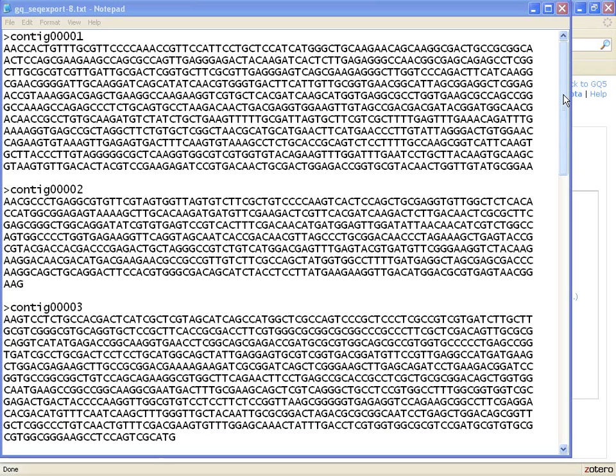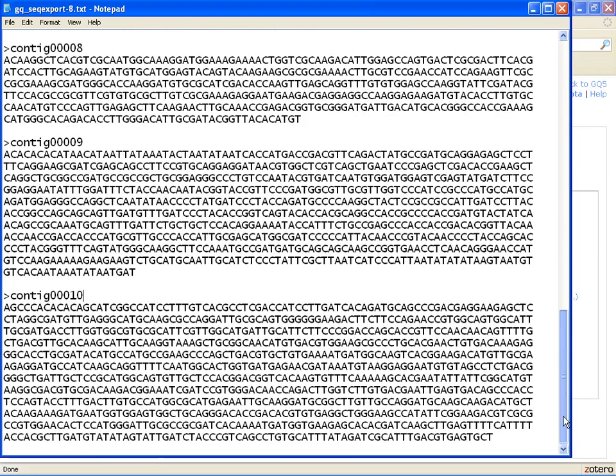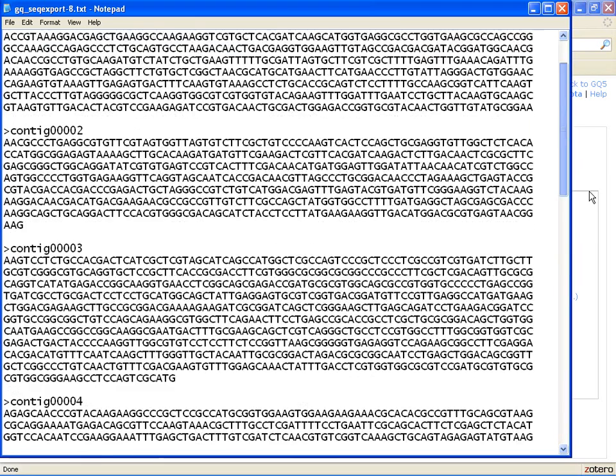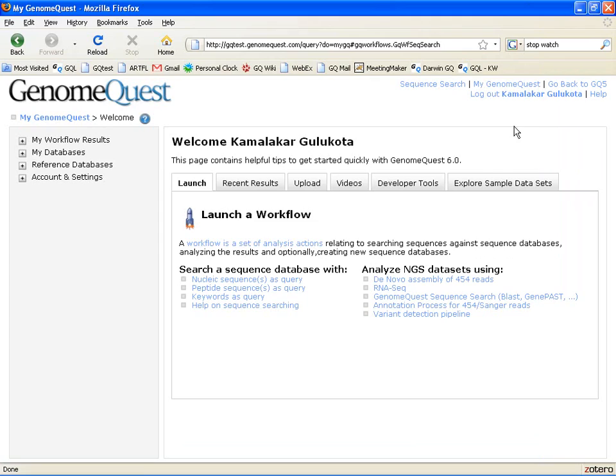Here are the 10 query sequences for which we would like to find new matches. In GenomeQuest, the way to do that is to go to the sequence search page, which is accessible from the top right as a hyperlink.